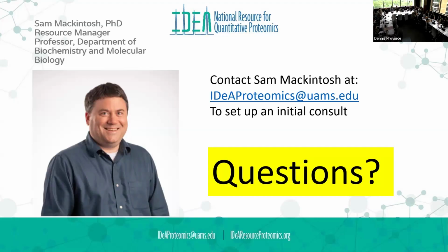Good. I have two more questions. With regards to the samples, I'm working with whole blood plasma samples, and we have a variety of good plasma for start off, from really expensive tubes to the regular EDTA tubes that we can use. What would be your recommendation?